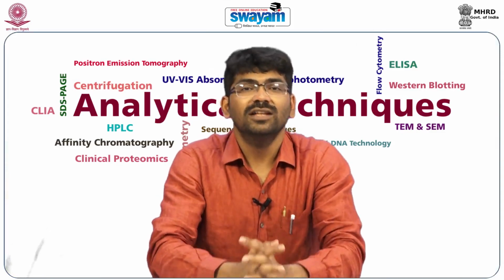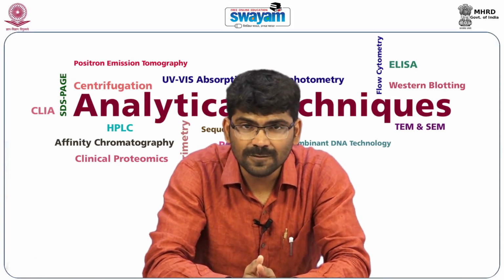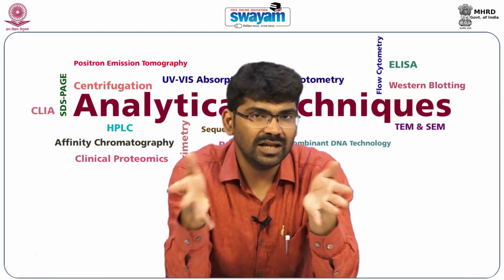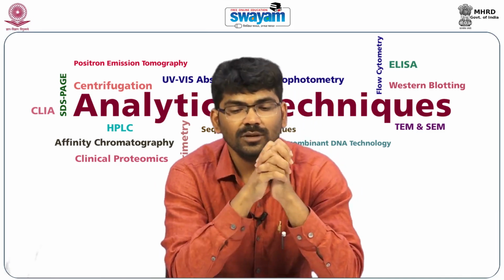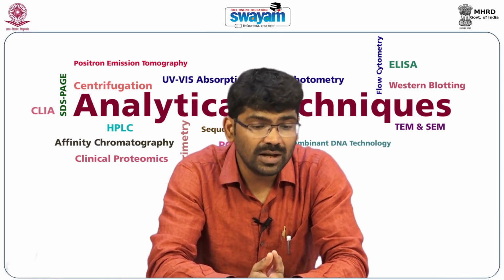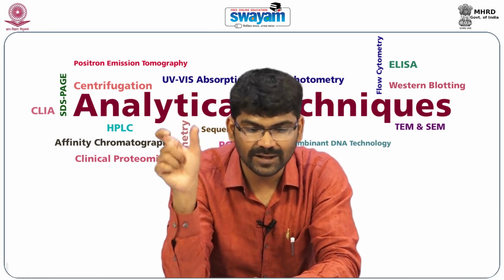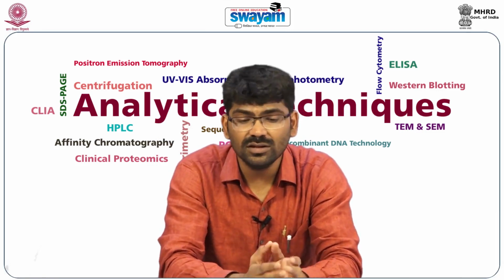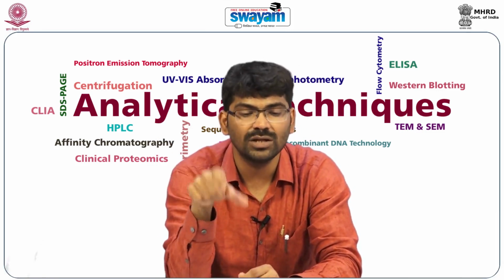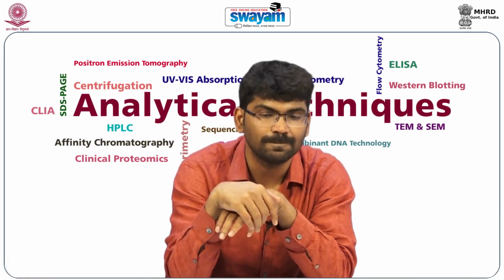So dear friends, I hope you have enjoyed this lesson. Let me summarize what we have learned in this lesson. Blood samples need to be collected in appropriate blood collection tubes and need to be inverted in a specified manner. Centrifugation is the process of separation of particles from a solution according to the size, shape, density and viscosity.